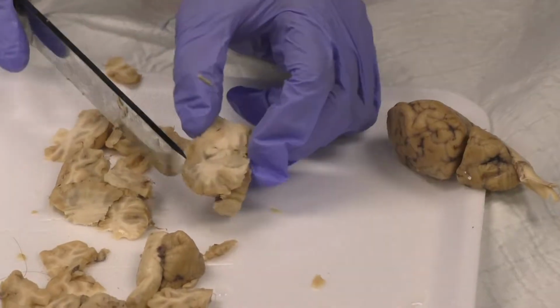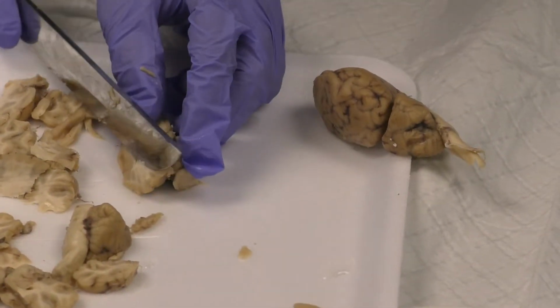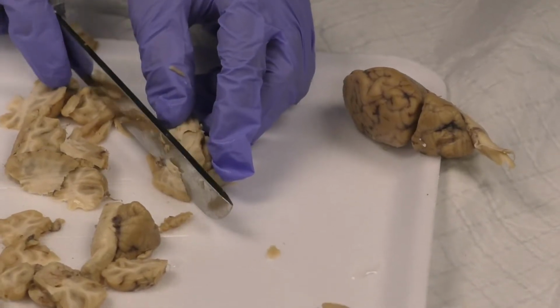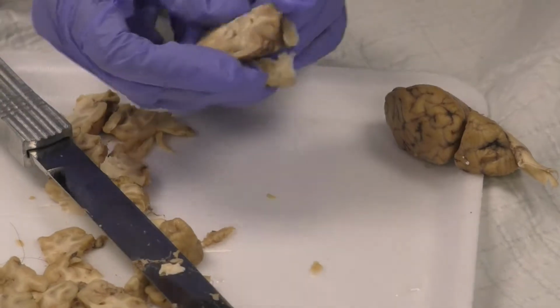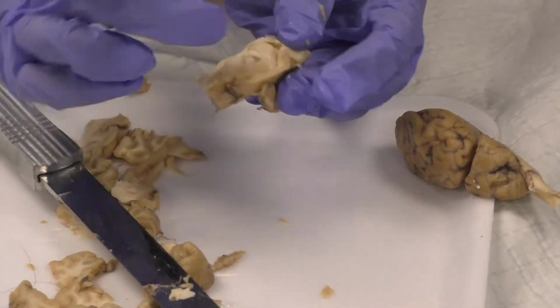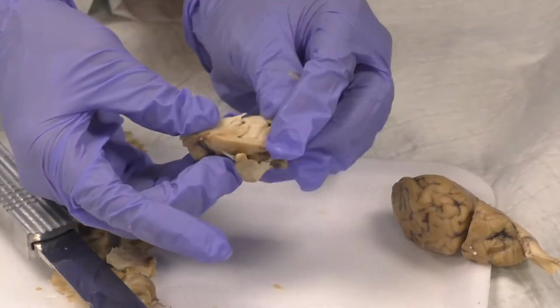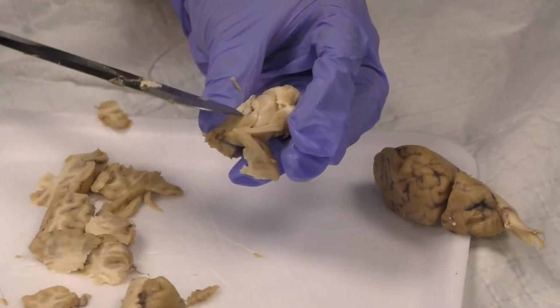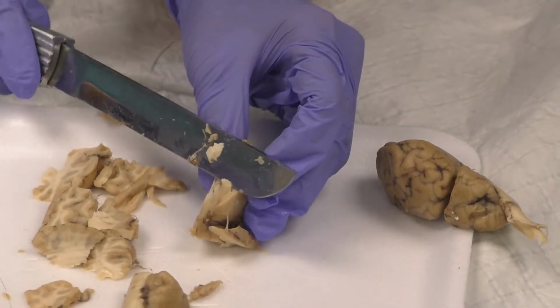You can really see it's a separate structure. Yep. Just like a piece of garlic. It does, yeah. I will never look at garlic again, thank you. Those sections look like food, you know. Look, you can see it go all the way down. Oh, yeah. And that black stuff there, that is part of the choroid plexus.